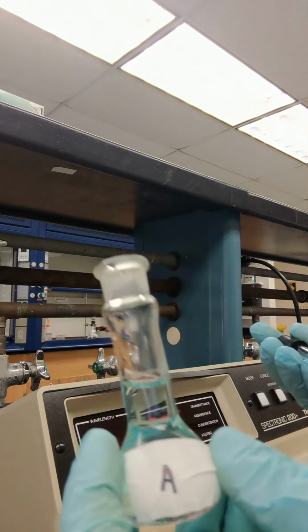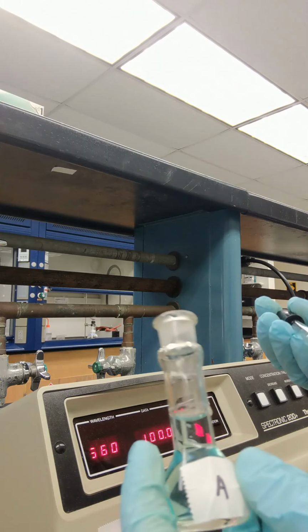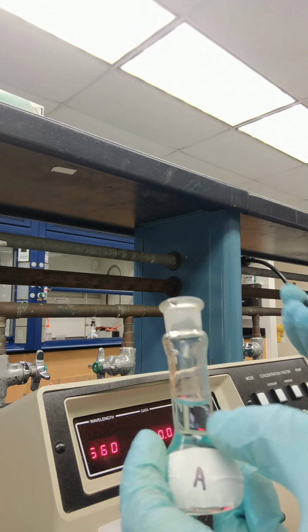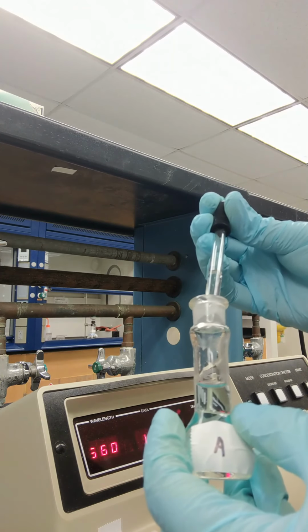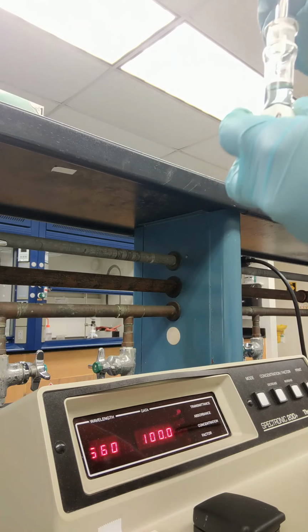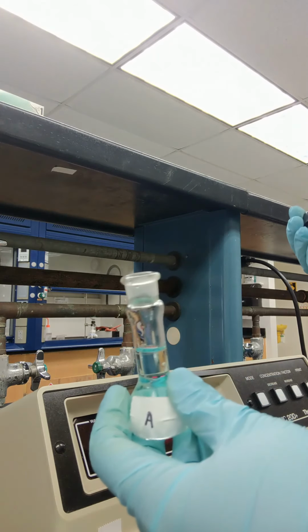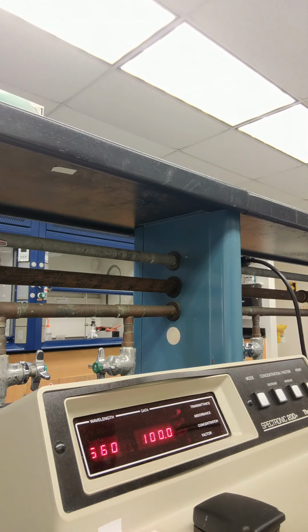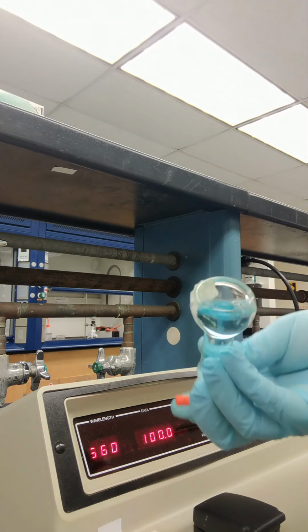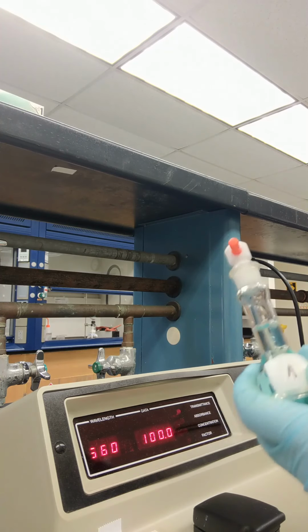So again, I'm finishing up adding the distilled water to the volumetric flask to complete the volume all the way to the line of 10 milliliters. Once you're close to that line, we should use the dropper, adding drop by drop until we can see the meniscus align with the calibration line in the volumetric flask. So I'm done with this one, and I have all of my other standards ready. Cap and mix before determining the absorbance for these solutions.